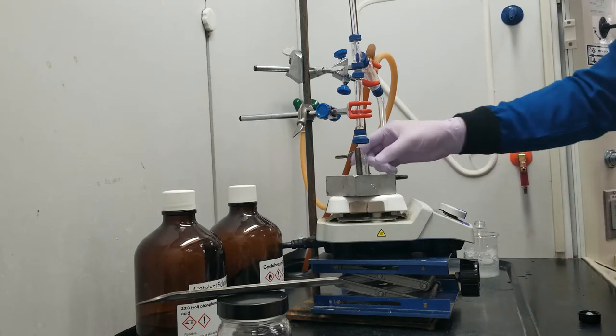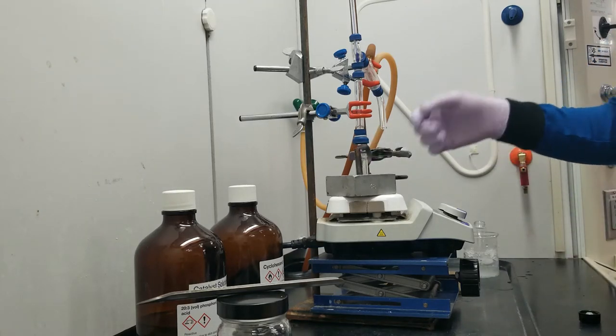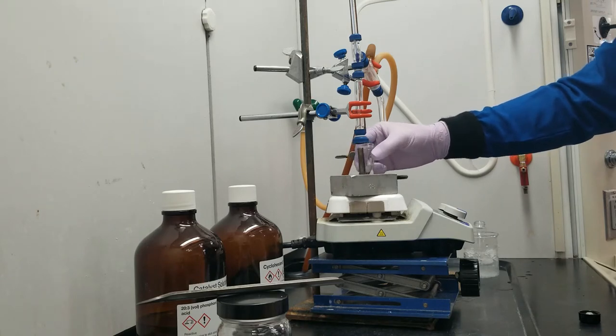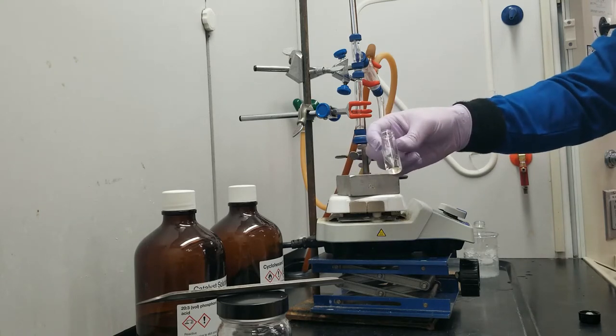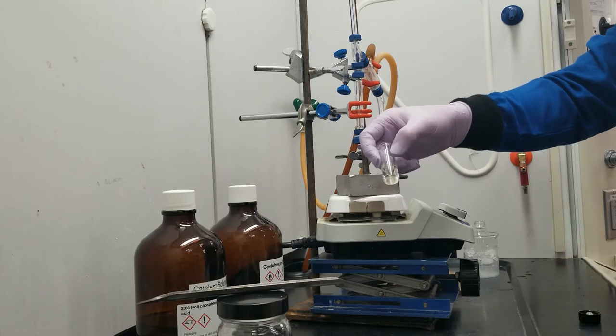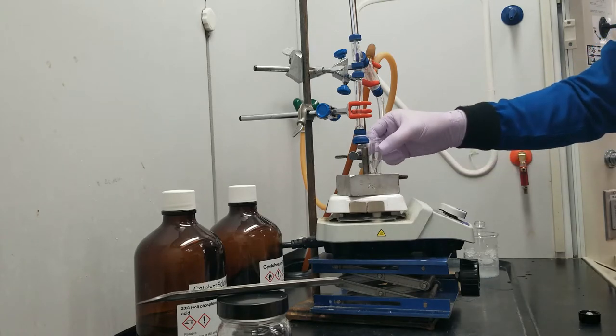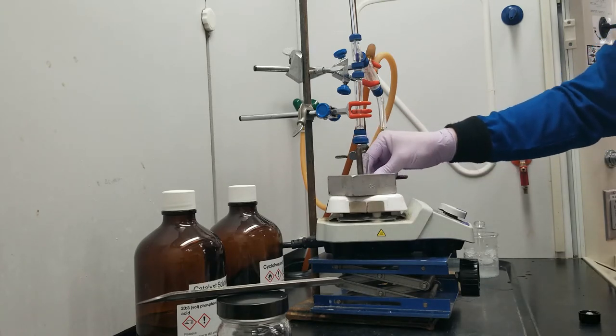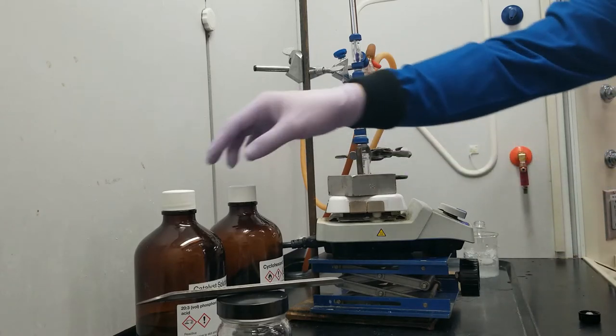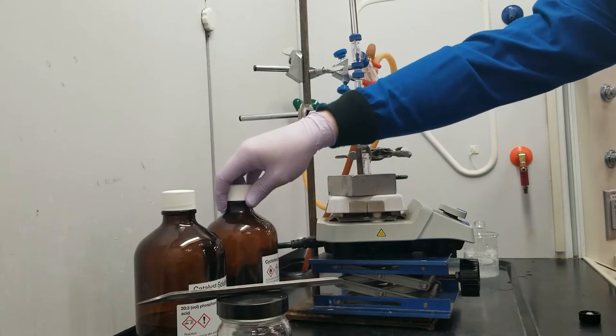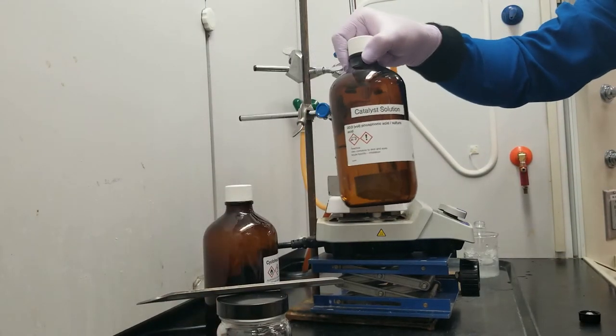So it's going to be on a much smaller scale, so we're using smaller equipment. Our reaction vial is going to be a 5 milliliter micro vial like this, and that's where we are going to heat our cyclohexanol and our acid catalyst solution.